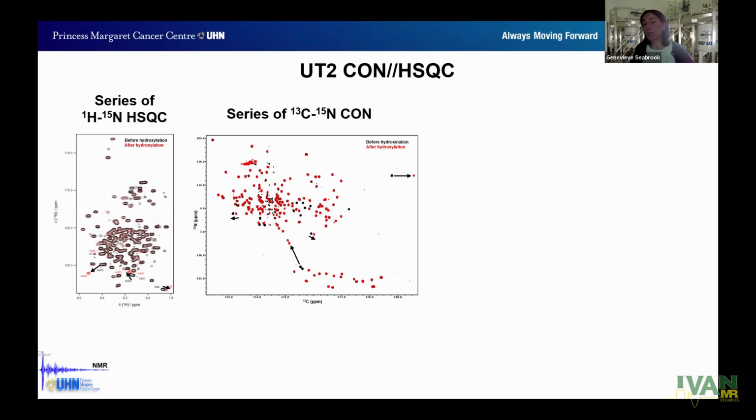But it's a very interesting question. I mean, it's still pretty good because if you run the CON on a high molecular weight disordered protein, assuming you go to a high field, you will still have a beautiful dispersion. So I don't see a problem.